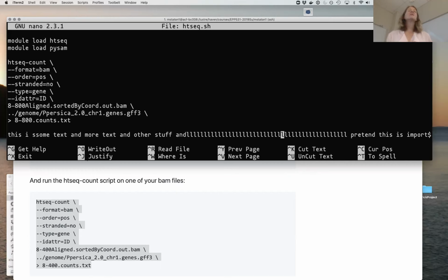So Nano is not our preferred text editor. It is, however, super easy. You can learn it in 5 minutes. Vi, Emacs, and other text editors are much better. They're not going to give you this sort of not-awesome behavior. But if your line isn't wrapping past the end of the screen, it should be fine. Yeah, I apologize for the interjection. No, that's okay.